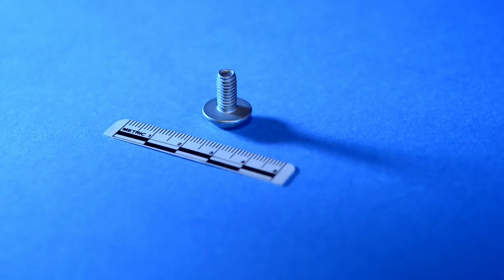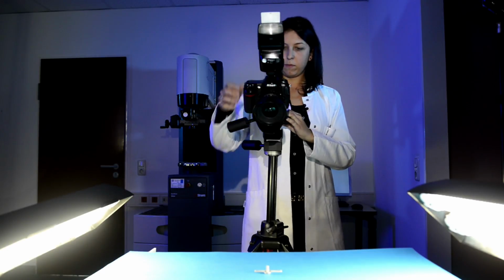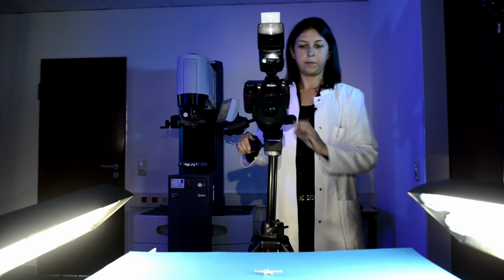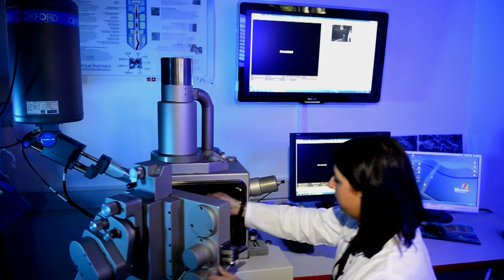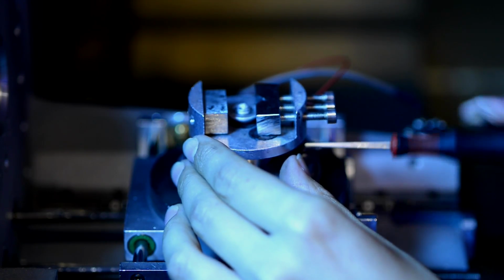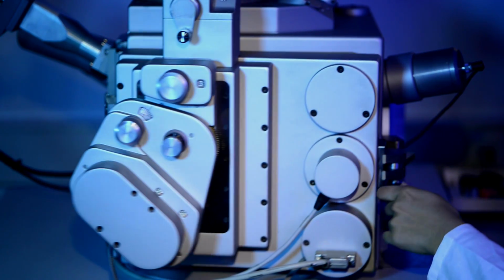Due to the large number of potential reasons for the damage and analysis methods, the selection of the right examination method is decisive in order to quickly reach a meaningful conclusion. For fracture identification, a scanning electron microscope is used. Here you look to see whether the fractured surface is a brittle fracture or a ductile fracture. Due to the variety of damage cases, scanning electron microscopy is increasingly used to determine samples as regards their structure.